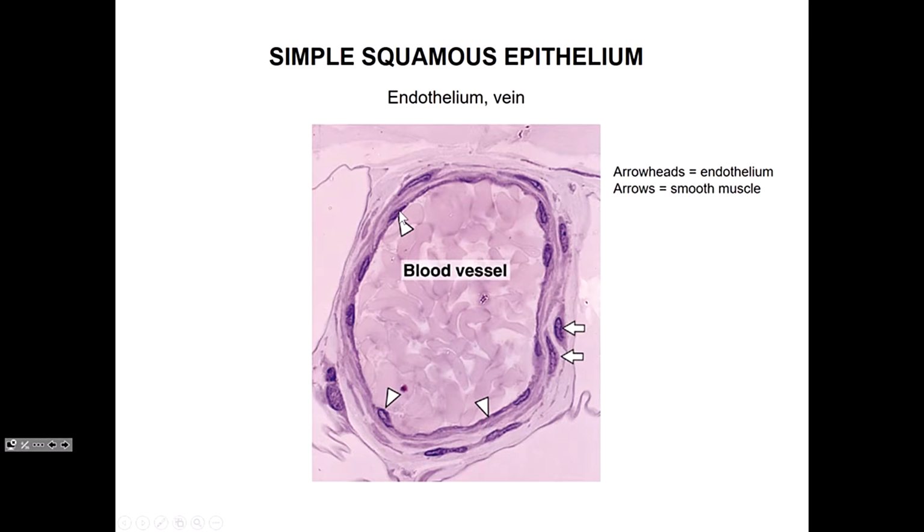So based upon knowing what it is, I know that that's smooth muscle surrounding it. There are ways to stain for smooth muscle, specifically. It's not skeletal muscle and it's not cardiac muscle, so it has to be smooth muscle. And you'll be able to distinguish between those three types of muscle when Dr. Notaria gives you the structure of muscle.